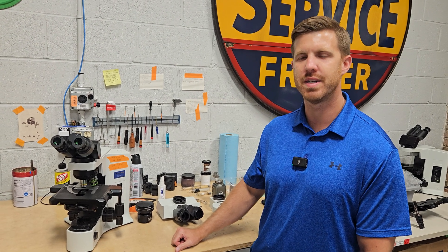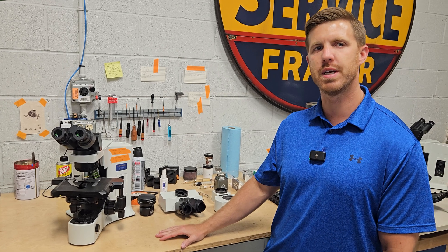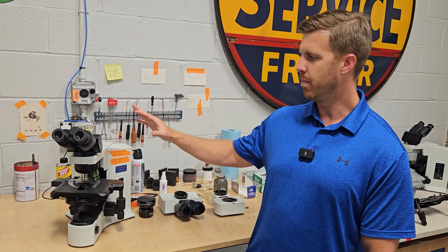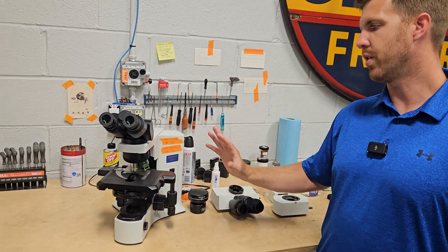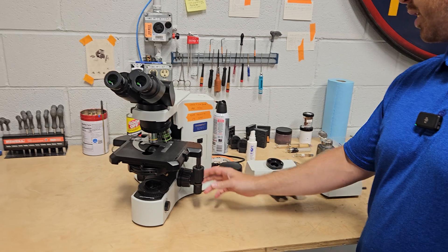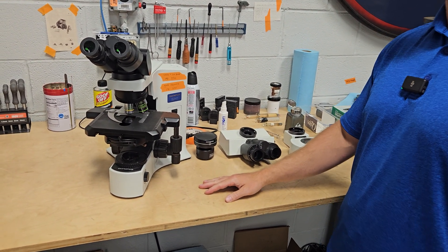Hey, this is Chad with Monday Scientific and today we're going to answer a couple of questions about adding a camera to your Olympus BX scope. Most of the configurations are going to have a tilt head like this, and this is a great scope, great configuration. But if you want to add a camera, there's a couple of ways you can do it and we get this question a lot.